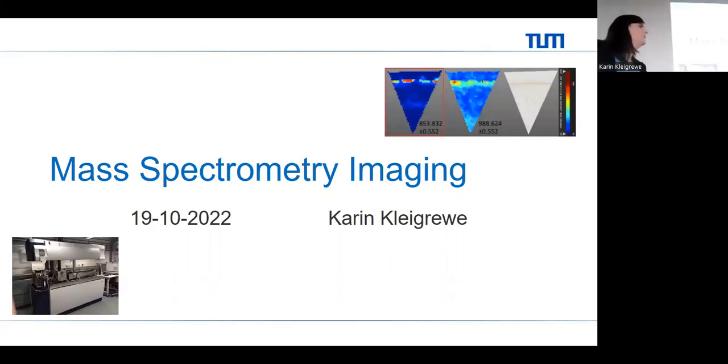So we used to have MALDI imaging here in the BayBioMS. Unfortunately, our MALDI just died. The laser broke, and it is too expensive to repair it. And also, I will come to the end. It is a nice machine. Michael Schrader also likes it.